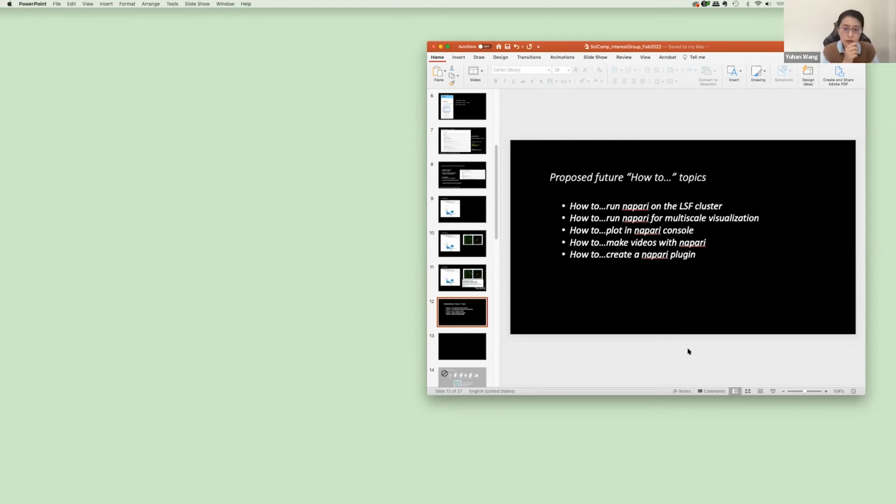Yeah, I'm even having troubles just looking at the stitched files, the N5 format you were talking about. I probably should do more reading and study that more, because I had some troubles loading that in as a pyramid. What I'm currently doing is loading it at different scales as one NumPy array or a Dask array, but I haven't successfully loaded it as a pyramid, basically having all the images with all scales. So that could be interesting to learn how we could do that.